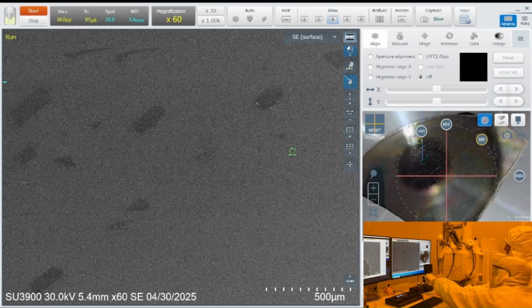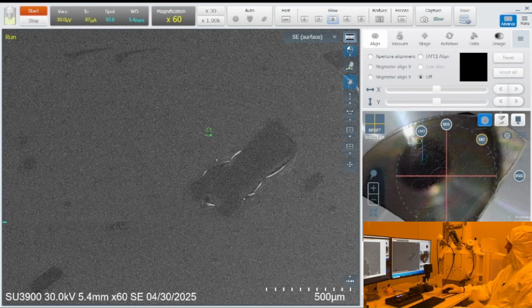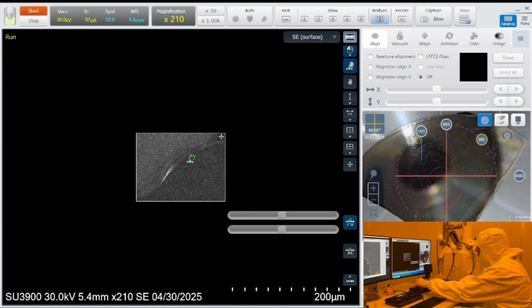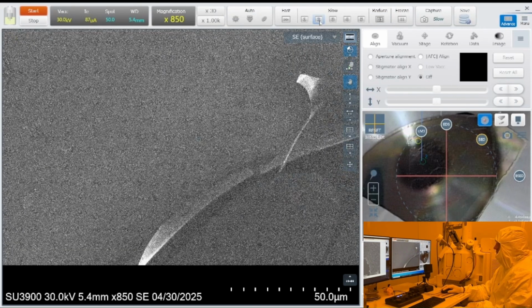So that's 500 nanometers, right? No, no. Yeah, 500 microns. One unit. Divide by 10, so 50 microns. Oh, 50 microns, sorry. Yeah, maybe we need to go a little bit higher mag than that. But maybe 50 microns. Let's see if you're able to see this magnification.